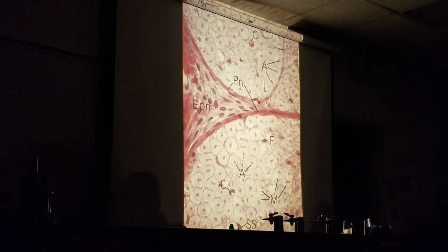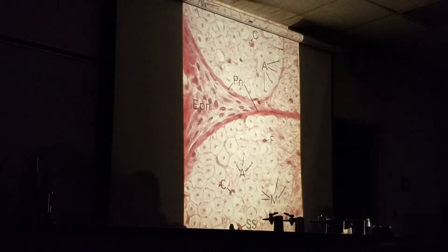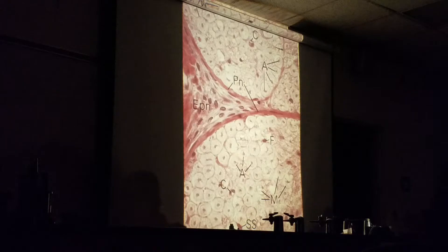So you can see all the little dots — that's the peripheral nerve cross section, all the nerve fibers.